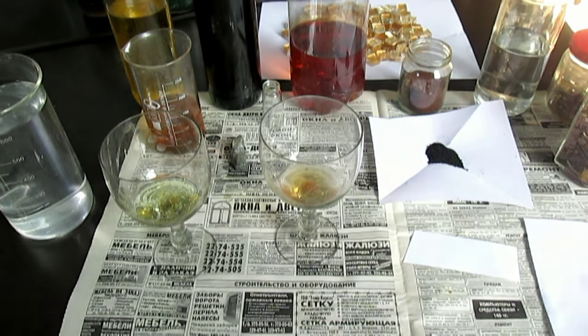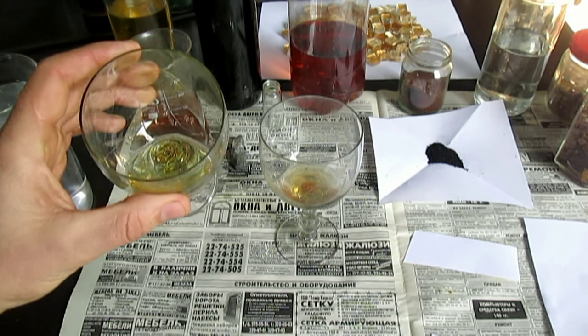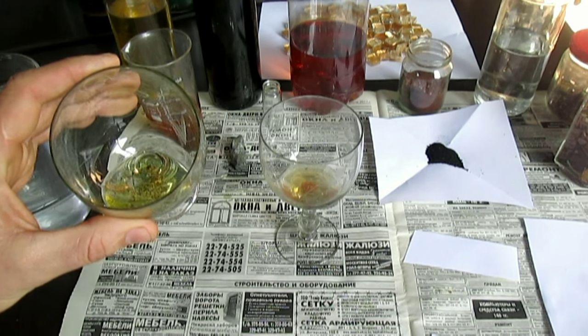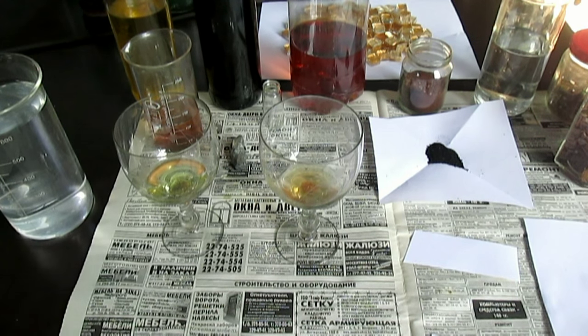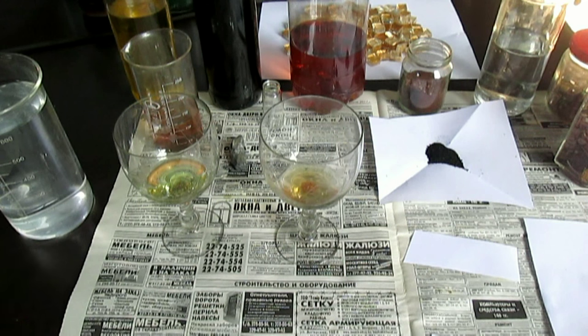Ну вот, золото в царской водке начинает растворяться понемногу — что-то начинает уже. Но очень плохо, медленно. Уже почти 20 минут прошло. И здесь уже растворилось наполовину золотишко. А раствор как был такого же цвета, так и есть. Золото, растворённое в суперреагенте, имеет прозрачный цвет.